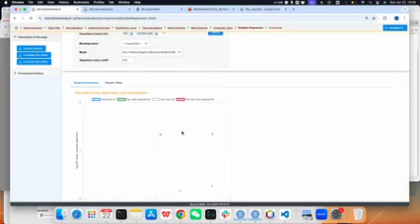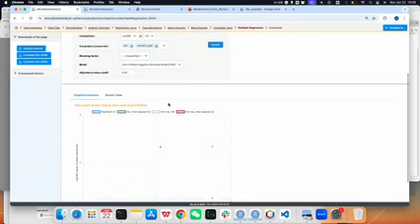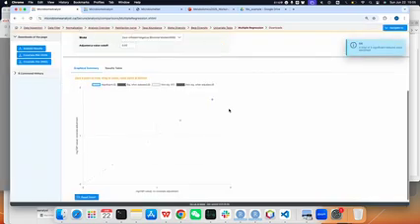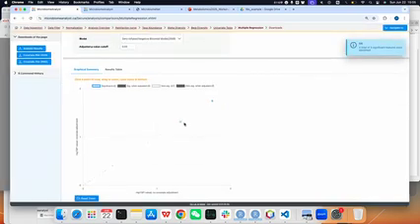The blue is without these covariates, and the green is when you put them into the model. I can show you, if we don't have covariates, we only have the blue ones. You see, you have only 3 features here.